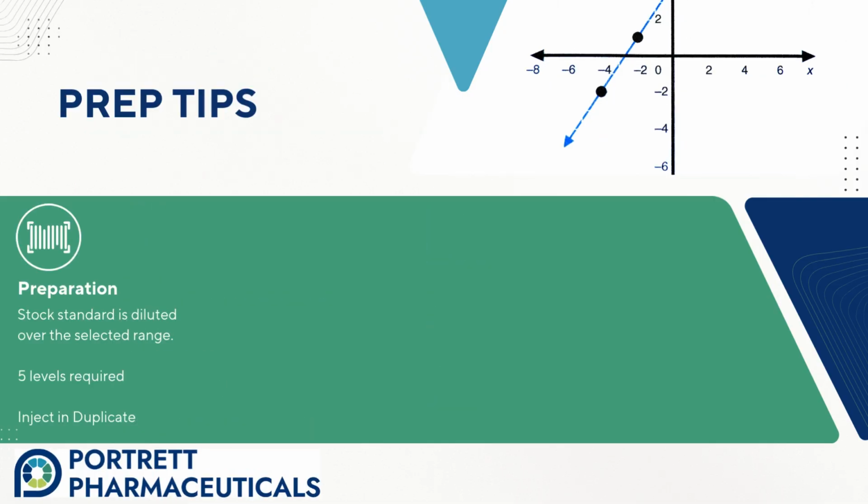When preparing linearity solutions, a single stock should be prepared and all dilutions performed from that single stock. Serial dilutions may also be used. If material is available and quantities of solvents or solutions are not restricted, a good rule of thumb is for your stock to be 10 times the concentration of your nominal or 100% level. This makes the dilutions easy to manage and plan for with typical glassware sizes. If using this route, ensure that the analyte is soluble at that concentration prior to getting started.